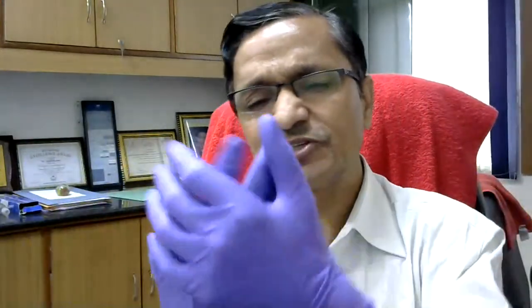So after doing all these things, the glove is full of ethidium bromide, and I said ethidium bromide is carcinogenic in nature, so that should not come in contact with my hands or my skin. I should not somehow ingest ethidium bromide, otherwise all sorts of cancer will be there. So I have to avoid touching ethidium bromide.